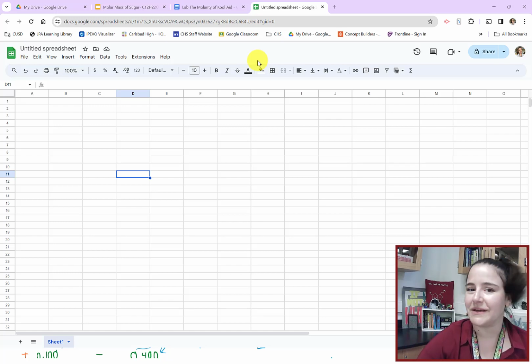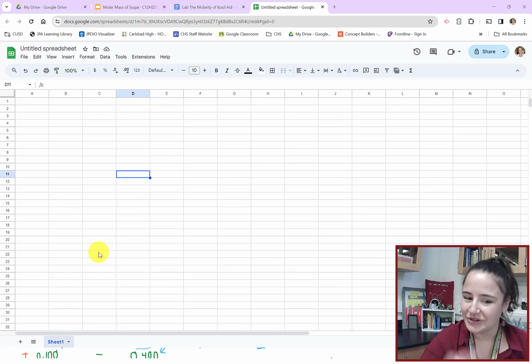Hey guys, Miss Peterson here, and today we're going to be learning how to use Google Sheets to do all of the analysis for our Molarity of Kool-Aid lab. We'll be learning how to use Excel or Google Sheets to do calculations for us and create our scatterplot graph.